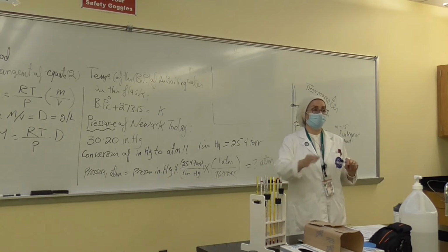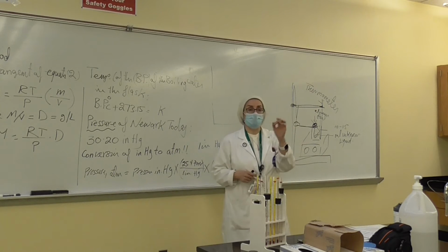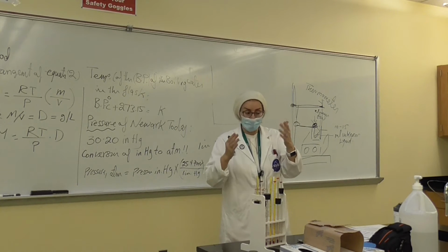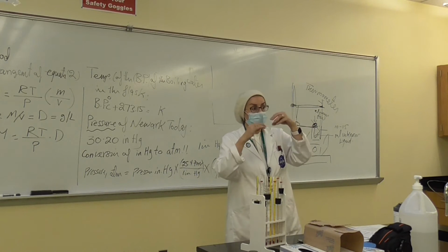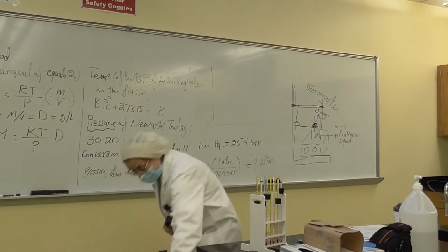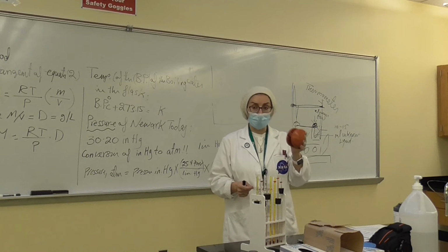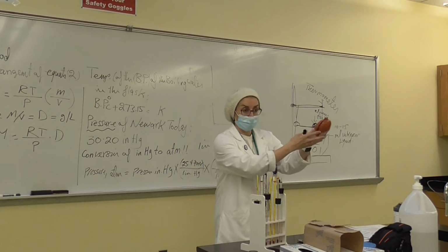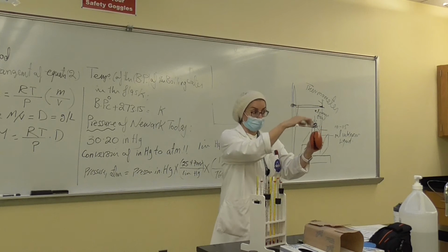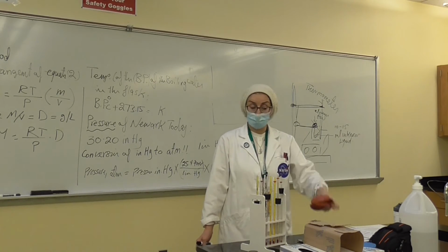So what are we trying to do here? Can somebody tell me? Why do you think we have to take that immediately when it is done? There is no liquid anymore. When you don't see it with your naked eye, and you do not observe any liquid inside the Erlenmeyer flask, remove it immediately. And we do have the rubber handle, because be careful, this is very hot, right? We remove it, we hold it, and then we put it immediately, just the body of your Erlenmeyer flask, not the neck, because you don't want to put water here, just tilted, and then put it under the running cold water.